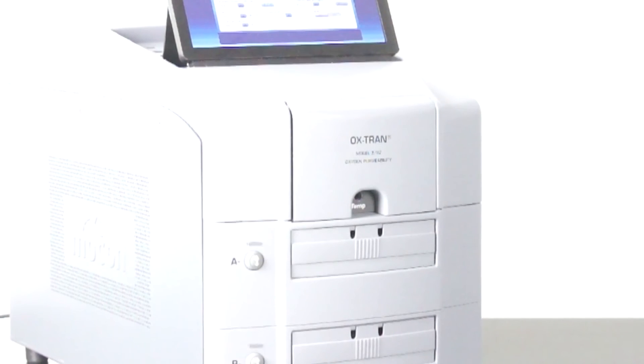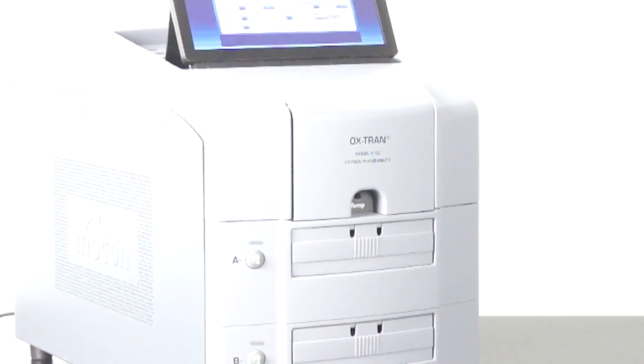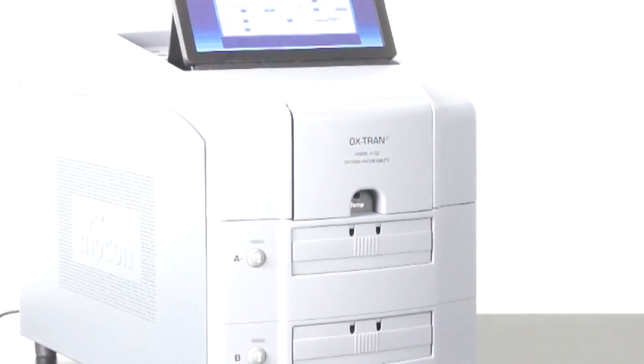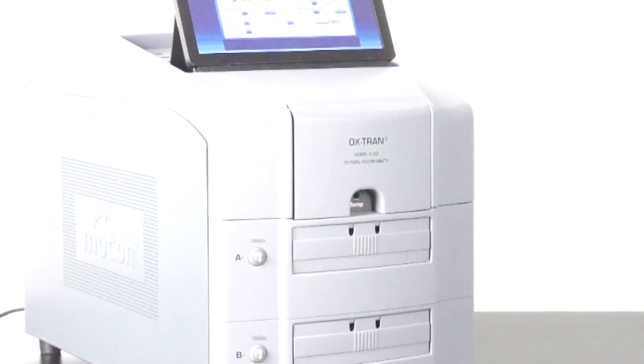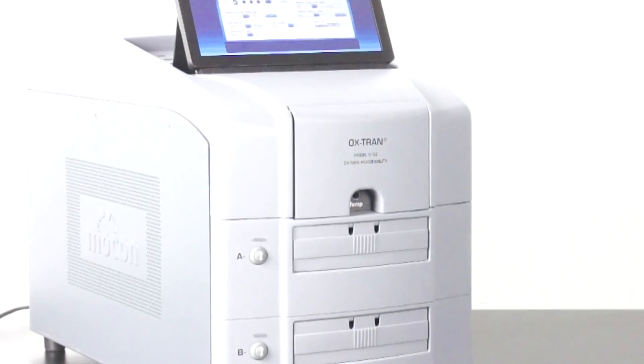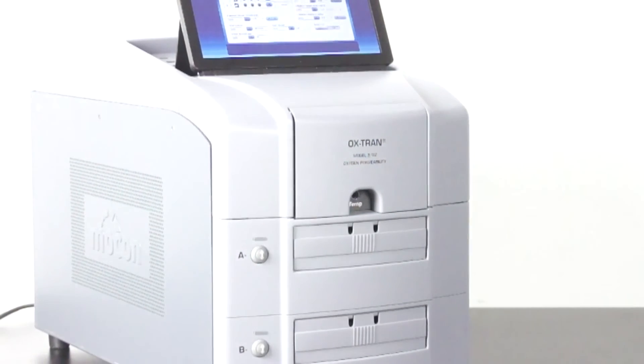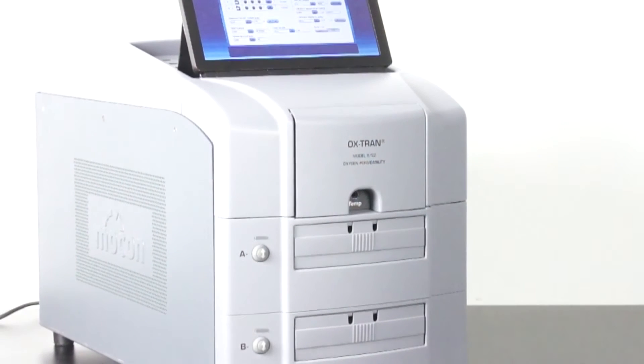In addition to the touchscreen, you'll be able to connect a keyboard and mouse via the USB port, should you prefer that style of access.